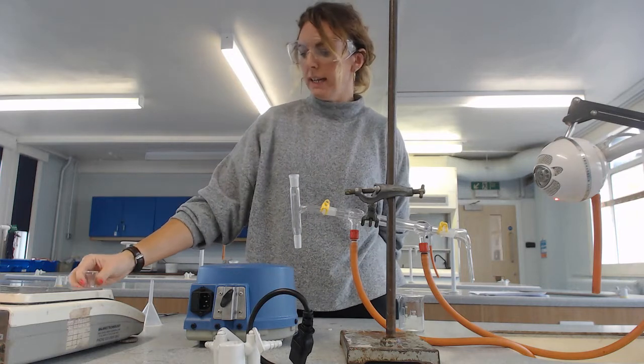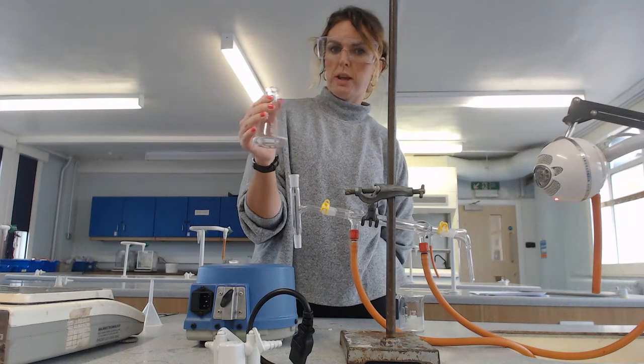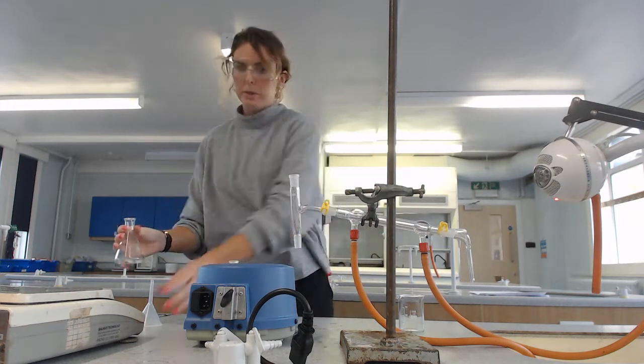Now, if there are any final impurities, distillation is going to separate them. So the first thing we need to do is transfer our product into a round-bottom flask.